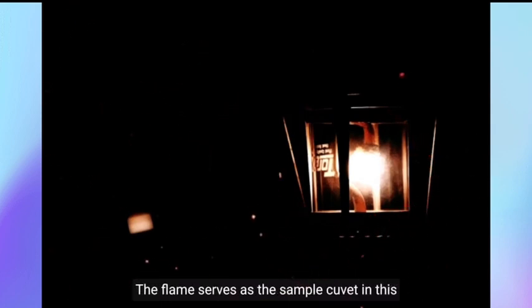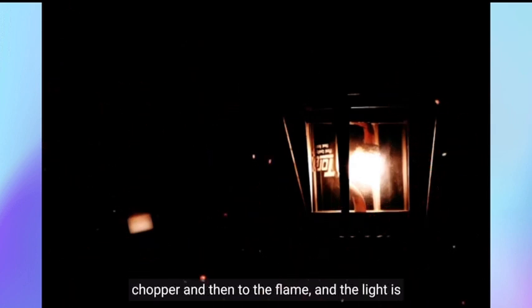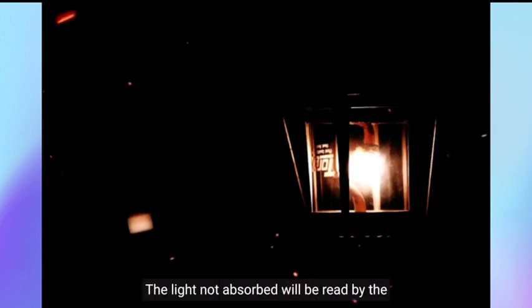The flame serves as the sample cuvette in this instrument. The light produced in the HCL passes through a chopper and then to the flame, and the light is absorbed by the metal in the sample. The light not absorbed will be read by the photomultiplier tube.